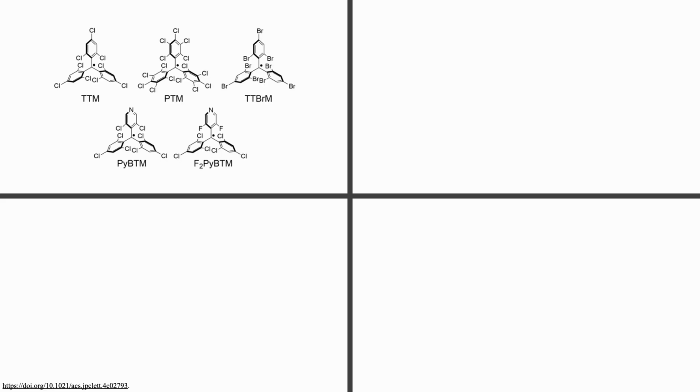So our first recent example is from a 2024 paper by Hattori and others, and they were looking at magnetic circular dichroism studies of these luminescent triaryl methyl radicals. They'd seen some cool absorption and emission properties previously, but they wanted to study them further, and it was suggested to do MCD. And so they proposed MCD of these racemic mixtures of these radicals at room temperature.